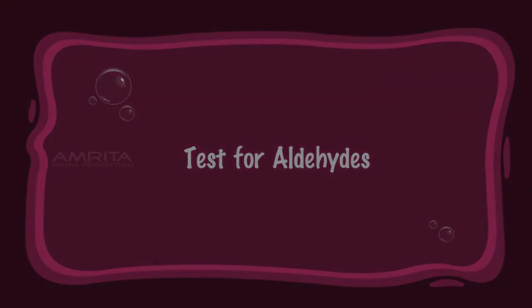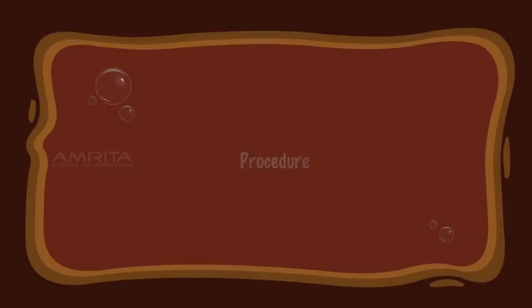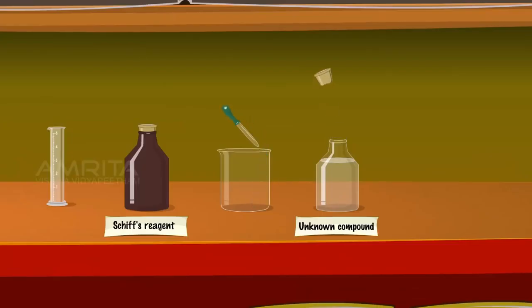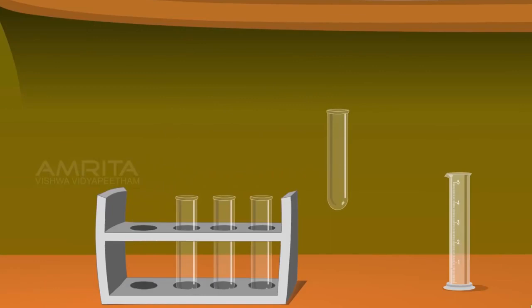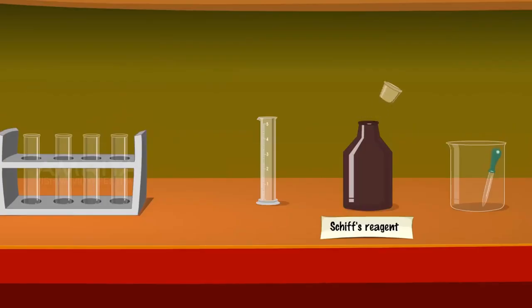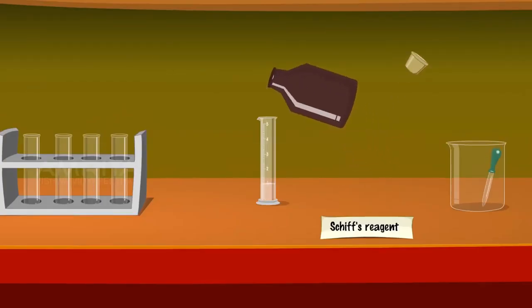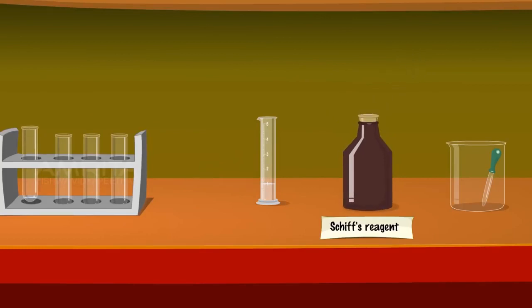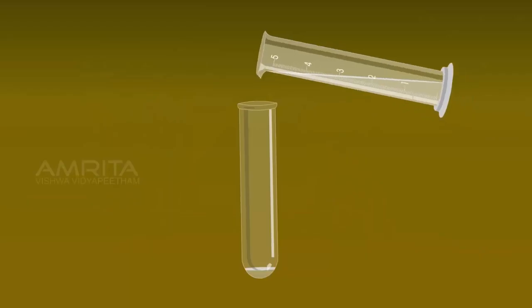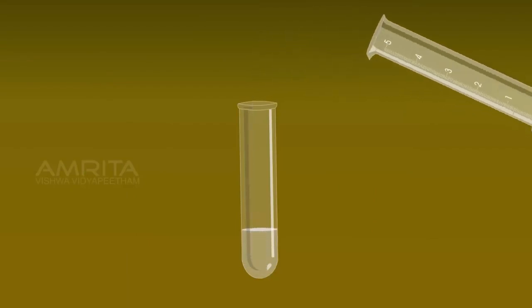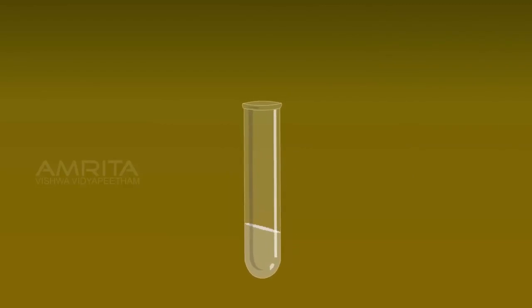Tests for aldehydes — Schiff's test. Procedure: Take a few drops of the given unknown solution using a dropper and pour into a test tube. Take 1 ml of Schiff's reagent in a measuring jar. Pour Schiff's reagent into the compound and shake it. The appearance of pink colour confirms the presence of an aldehyde group.